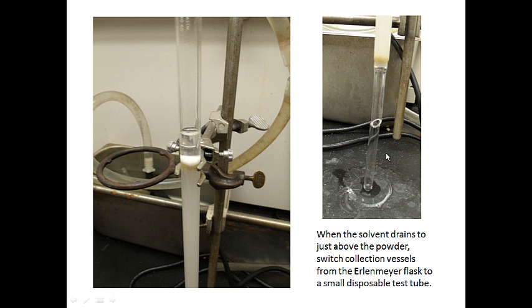not run dry. Now if you position the tip of your column at the right height, you'll be able to slide the test tube underneath the tip, and it'll hold it in place, and then the solution will drip into the test tube. If you're saying that's not what's happened here, actually this solvent is still left over from the Erlenmeyer flask. So our solution will then drip into the test tube, and as it does, the mobile phase is moving down the column and hopefully separating our components.